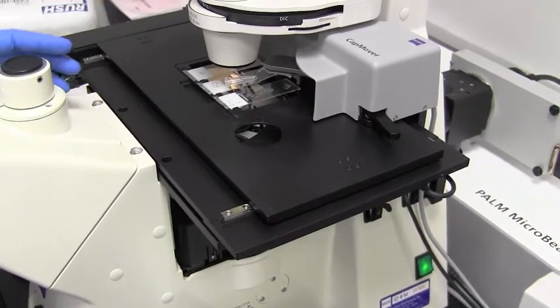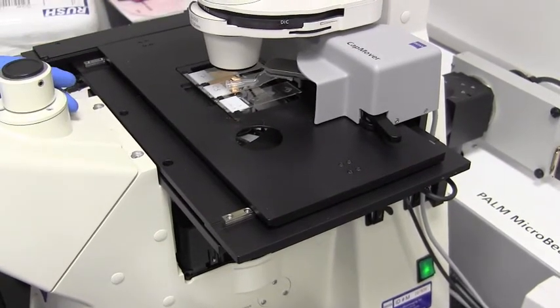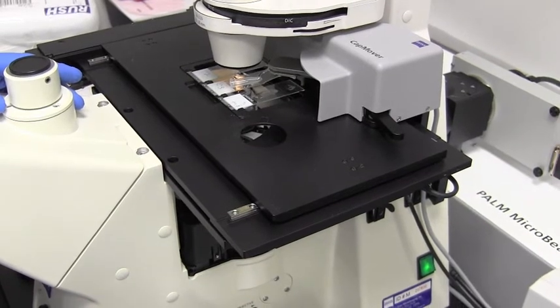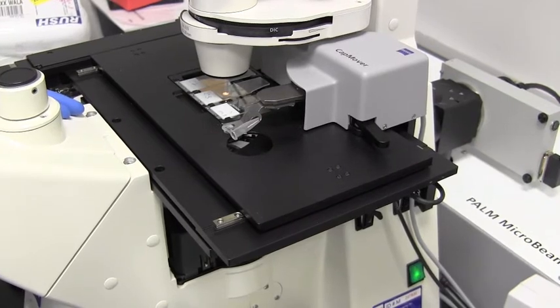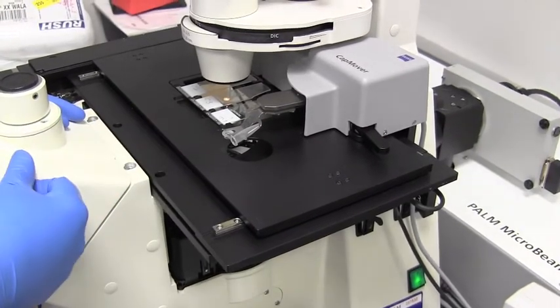So what that does is it moves the cap over the actual cells that we're looking at. Now if this is an opaque cap, you wouldn't be able to see through it. So that's why we're using clear for this demonstration. Once you're done your launching, you hold the red button down on the right again, and it moves it out of place.